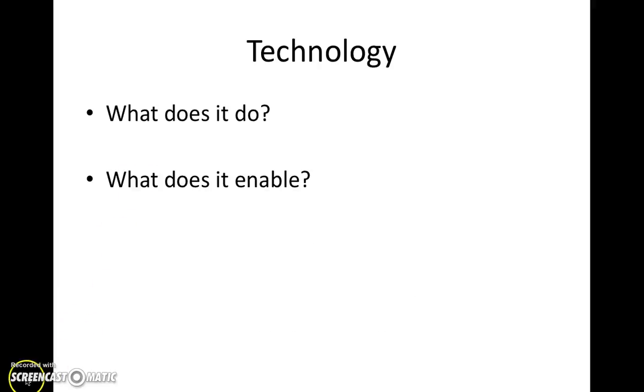So, what exactly is this technology? What are the Virtual Labs? What do they do, and what do they enable? As you might imagine from the name, the ChemCollective Virtual Labs are basically a chemistry lab put somewhere online in a virtual world instead of in the physical world around you.